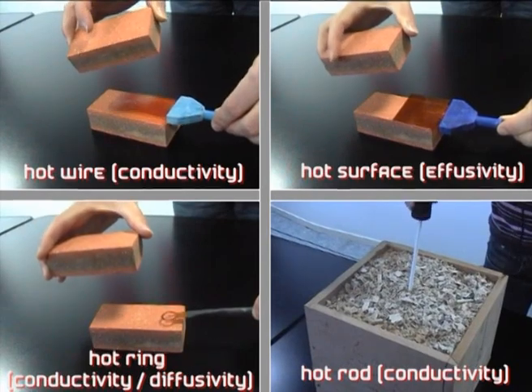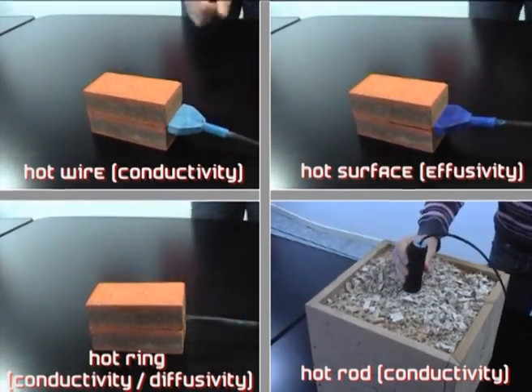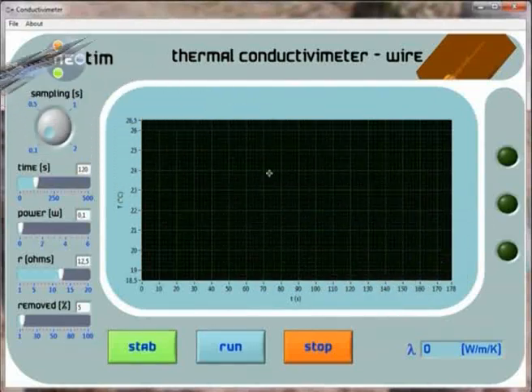These probes have different designs depending on the desired thermal properties, for example conductivity, diffusivity or effusivity.